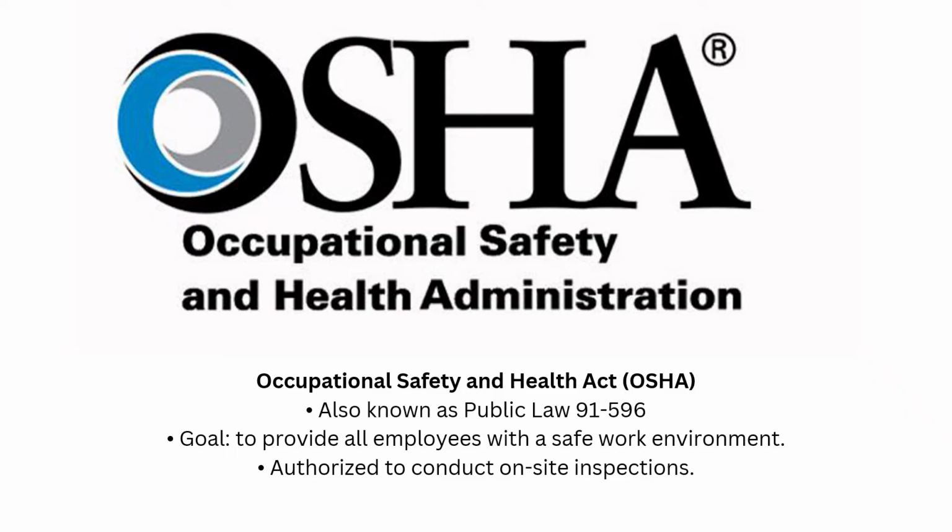Just to give you an overview of the bloodborne pathogen standard, this standard applies to all exposure to blood or other potentially infectious materials in any occupational setting.